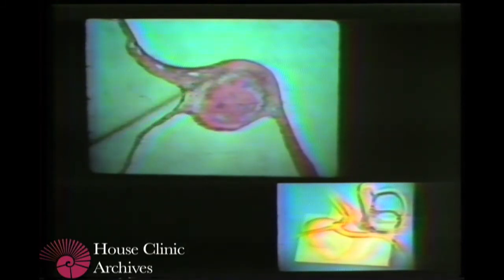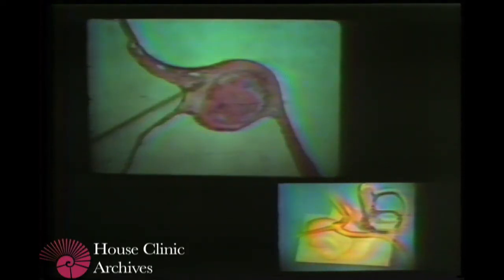This is the tympanic membrane at the level of the neck of the malleus. Notice in this area there is no fibrous layer such as we see here, and it is in this area that a primary acquired cholesteatoma can occur due to growth of the epithelium into unresolved mesenchyme in this area should it persist after birth due to a faulty eustachian tube. Here we see an adhesion stretching from the neck of the malleus medialward. These small adhesions are very common and seem to play no part in any type of conductive hearing loss.